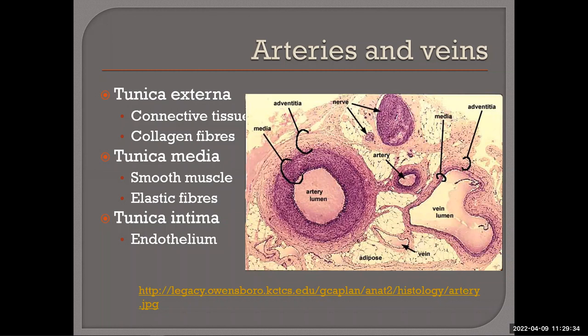And in fact, what you would notice, actually, this is probably just an artifact where we're looking at here. Artifact just means sometimes you have funny staining present, probably due to poor technique or staining contamination. But the lumen for the vein would actually be all here. This would be the end of it. So all of this would be the lumen. So in veins, actually, the lumens are larger, whereas in arteries, the lumens are indeed smaller.